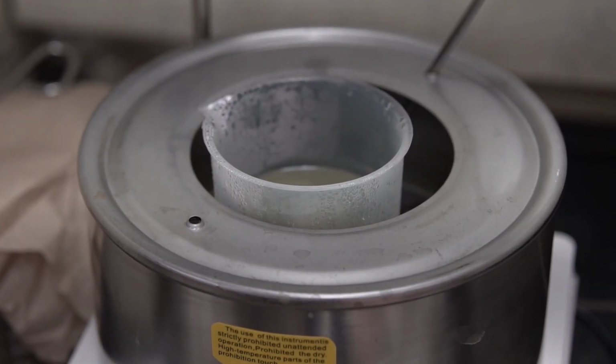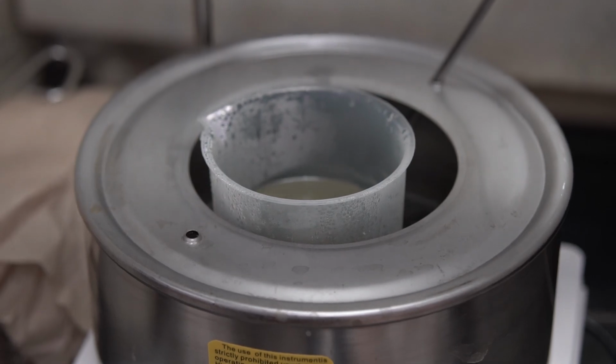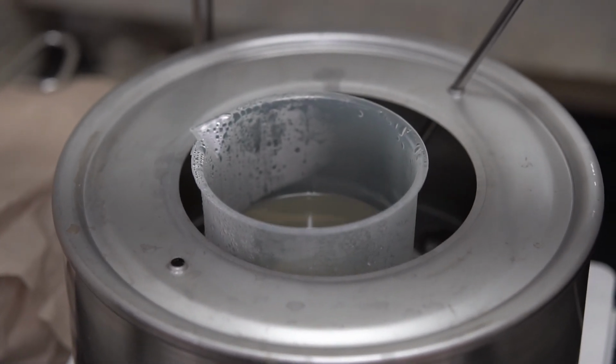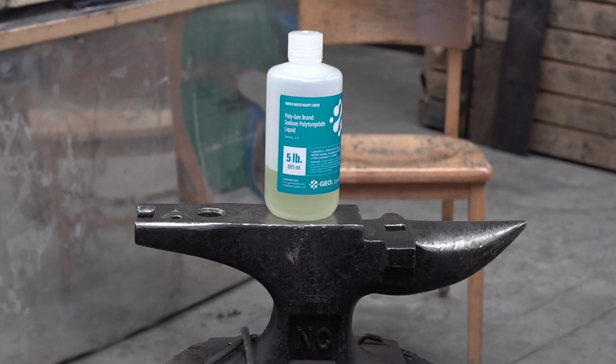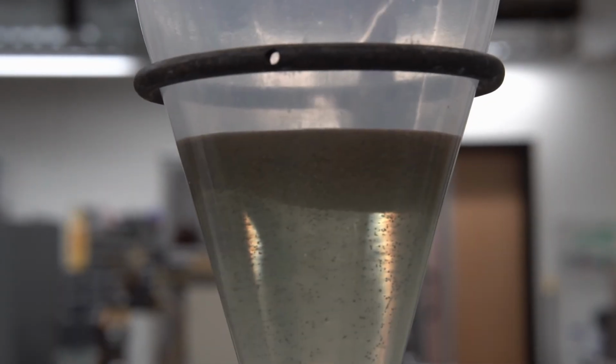You can reuse it several times by boiling off any water you added to dilute it and getting it back to a higher specific gravity. So that's really handy and helps out with the cost a little bit.